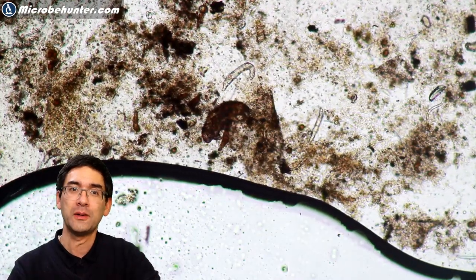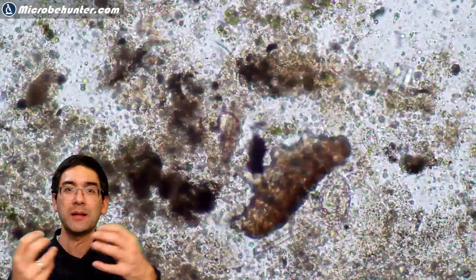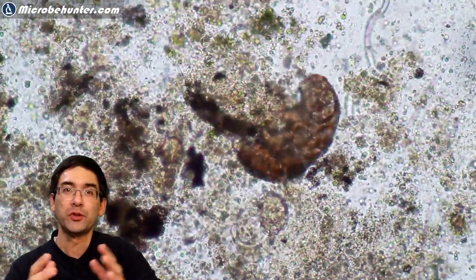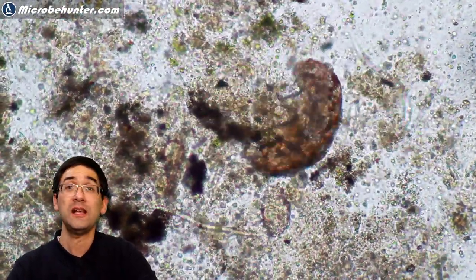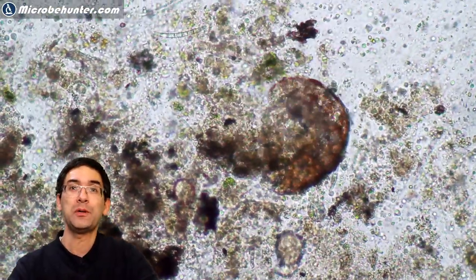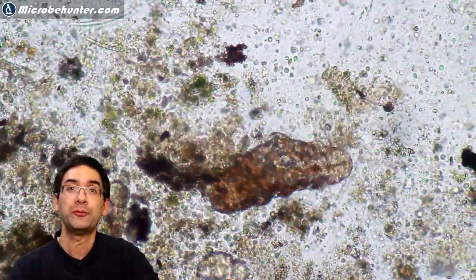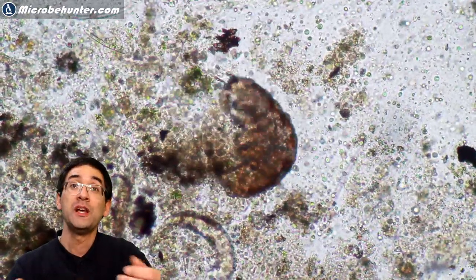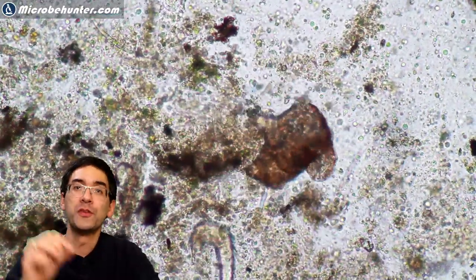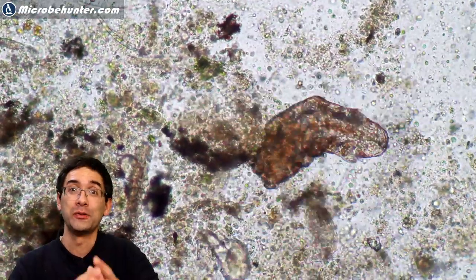It had some problems moving around because the highly viscous slime kind of inhibited its movement. But when I zoomed in I could see for sure that this is indeed a water bear. People also call it a moss piglet because tardigrades can be found on moss. All you have to do is take a small sample of moss, rinse it with water — this flushes off the tardigrades — then take a drop of that water and put it under the microscope, and if you're lucky you can find those little creatures.